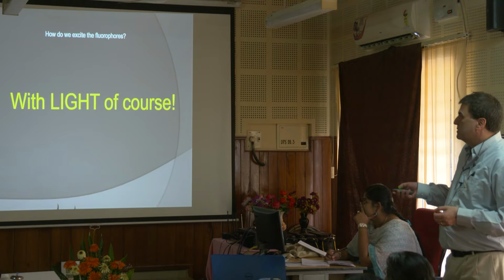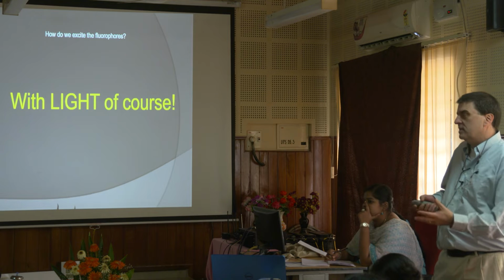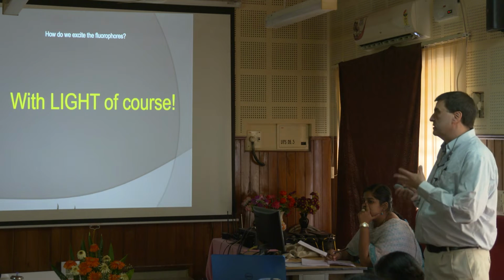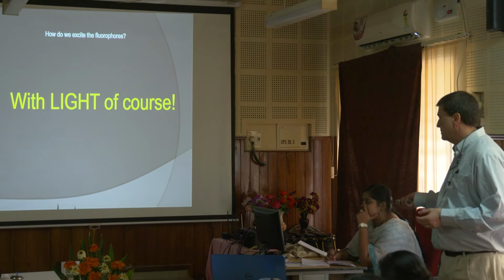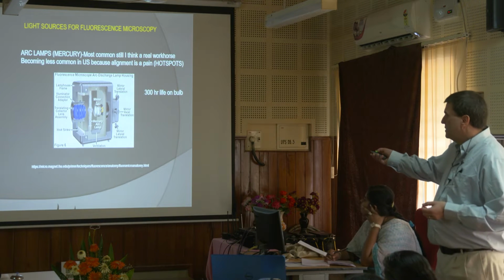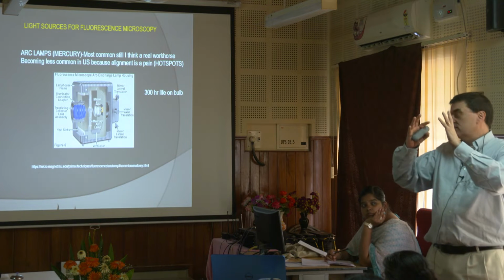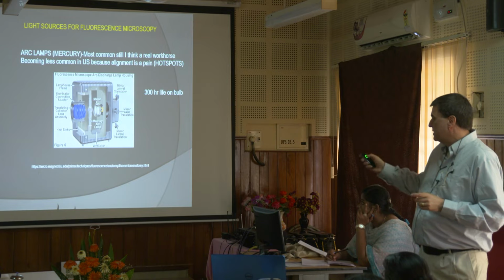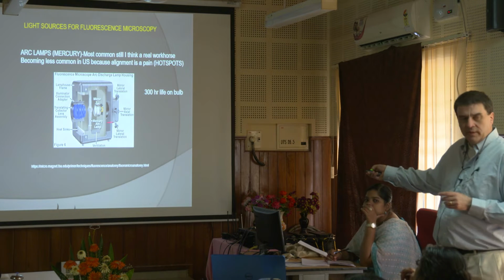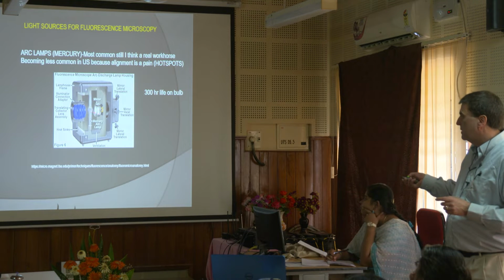So how do we excite fluorophores? With light, right? We're going to go over to the confocal, and we'll see the light coming through, or the microscope I use a lot at home, a wide field fluorescent microscope, I have a light that excites. In the older days, we used to use these mercury arc lamps, and they look like little boxes, sort of like this. They have an adjustable mirror to line up the fluorescent light. You might see them on older microscopes. We have quite a few in our building. I actually still have one in my lab.